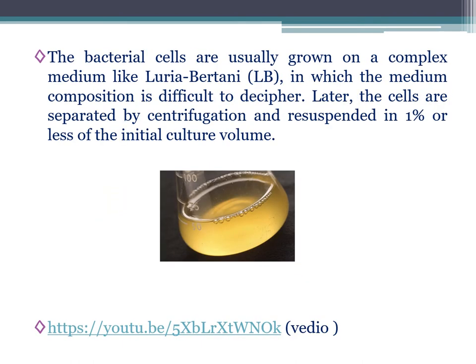The bacterial cells are usually grown on a complex medium like Luria-Bertani or LB media, in which the medium composition is difficult to decipher. Later, cells are separated by centrifugation and resuspended in 1% or less of the initial culture volume. Here, one link is given. You can copy down this link and later watch the YouTube video on how bacterial culture is prepared.